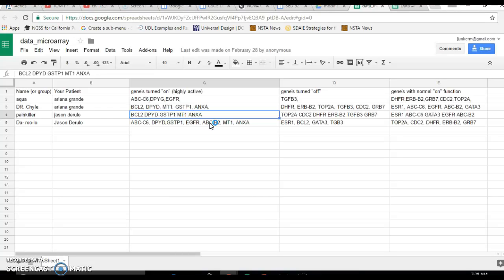But if you're short on time or you want to make sure you have more clear results for students, then the Cabbage lab should avoid these false positives and see a little more commonality and clearer results for different groups doing the same patient. Anyways, but you can see here the data sheet.